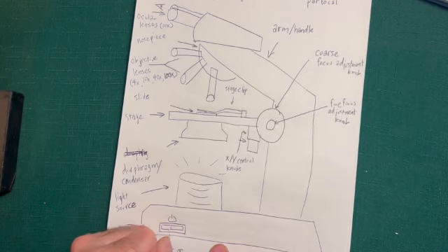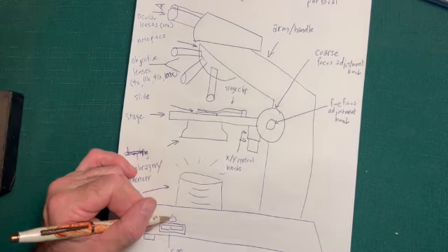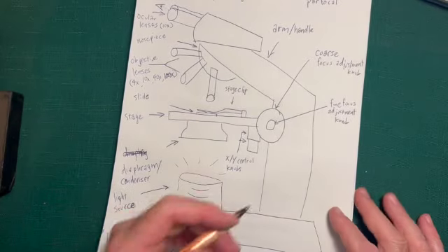And I've learned that this little thing, which hopefully recognizes like the power button or the on-off switch, is a stylized version of a 0 for off and a 1 for on. So there's the thing.